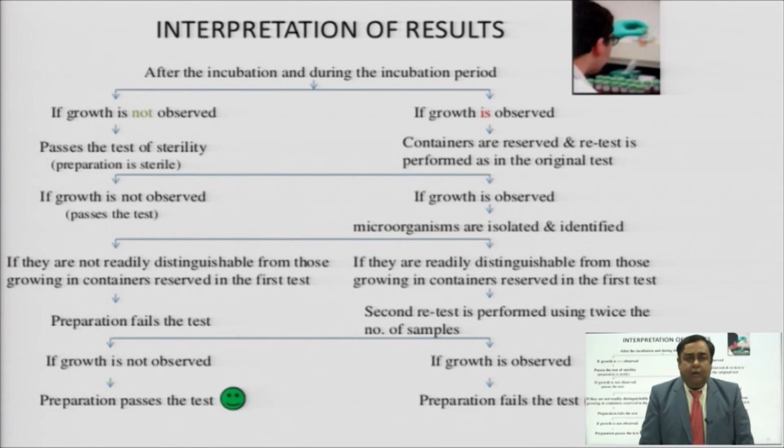After we put it in the media, if there is no growth, it means the batch has passed the sterility test. If there is growth, you cannot reject. You have to do a retest and see whether there is microbial growth or not. If there is no microbial growth on retest, the batch passes the sterility test.